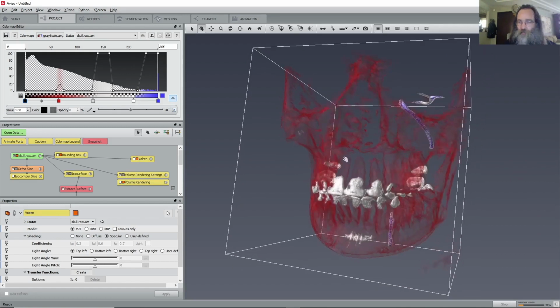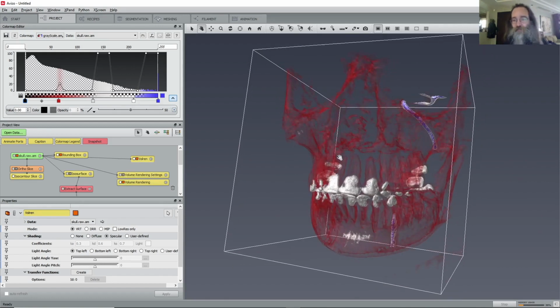Like this, yes, and that's what the volume rendering is. Again, play around, try to get used to what you can do with it, and happy exploring your data. It's volume rendering, and you've seen it's a nice way to quickly look at your data to get a complete overview, almost or as complete as possible, of what's in your data. You're going to use it also in the segmentation session, to actually look at the data before we try to segment it.